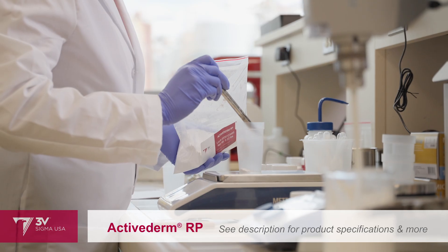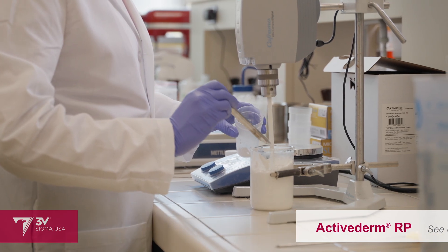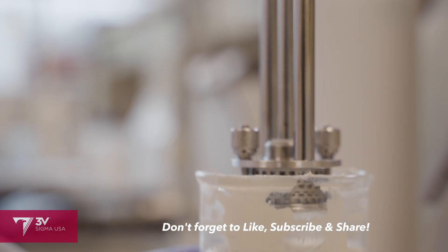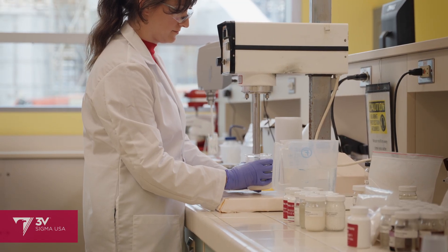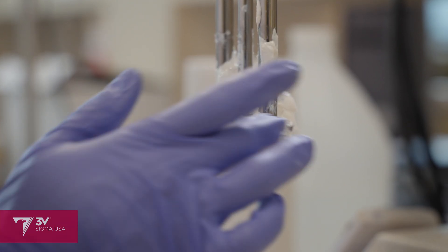The last trick up my sleeve for giving this formula the silky gliding feel is Active Derm RP, our cosmetic rice starch powder. It's adding one more note to that light velvety emollient accord we created earlier. After adding fragrance, we're moving over to the homogenizer. A thorough homogenization is critical to any product with dispersed pigments. We need the zinc oxide, titanium dioxide, and rice starch to be uniformly and finely distributed.